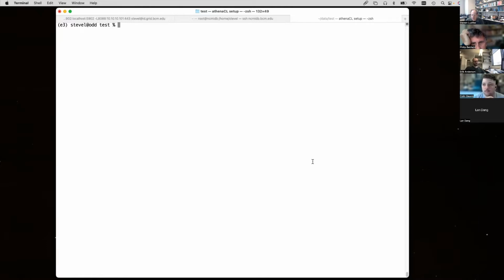It's not the sort of thing that you really need to do as part of processing. There's annotation tools, so if you're displaying something in a 2D image, you can put annotations on top of it. But there's no way of actually drawing into the image with some pre-existing function. So you have to use a for loop. And if you're going to be doing it thousands and thousands of times, then it should probably get implemented as a processor, like that Helix filter that we wrote, which is basically doing exactly what you're describing, just in Fourier space, not real space.